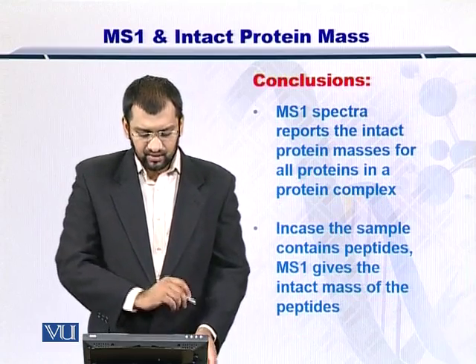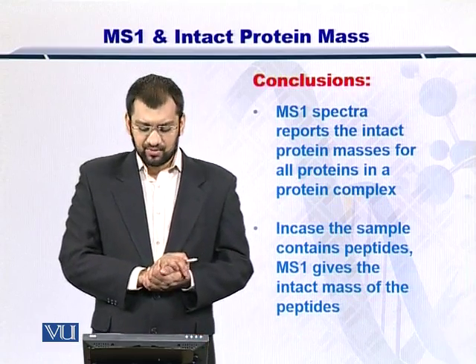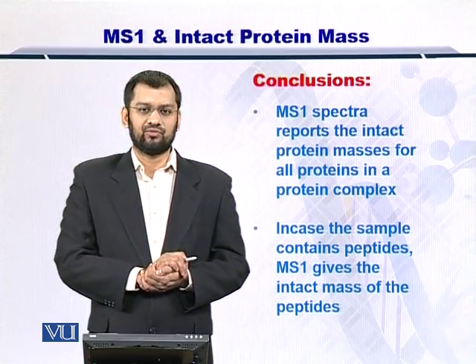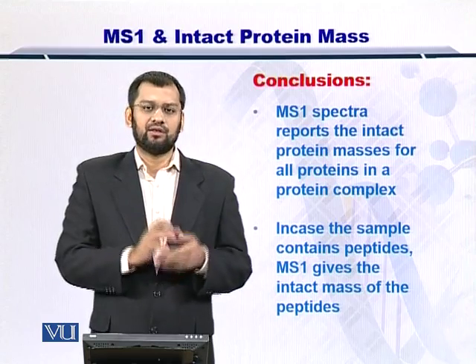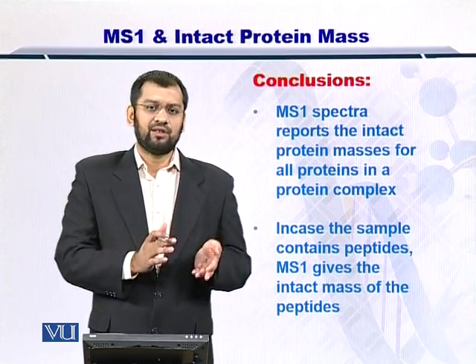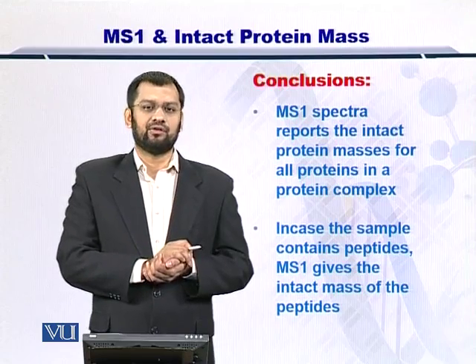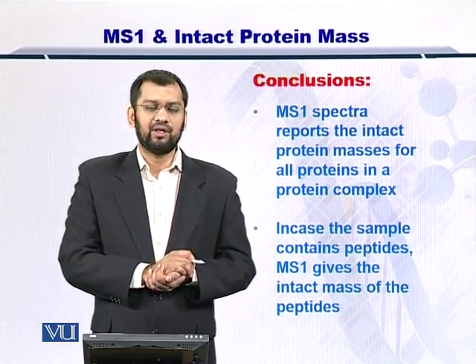So in conclusion, the MS1 spectra reports the intact protein or peptide molecular weight for you, and this is very useful when you want to have a mass select of a specific sample molecule for onward analysis.